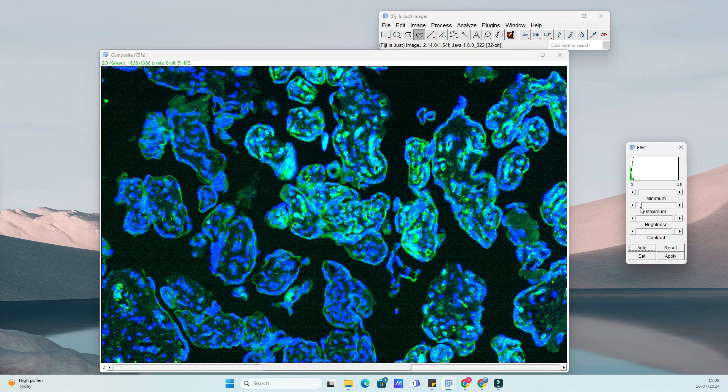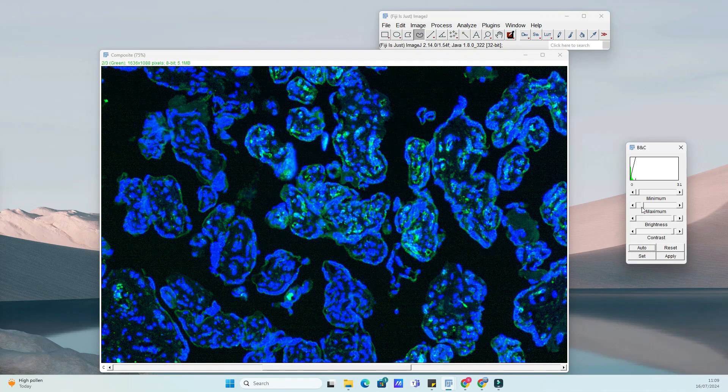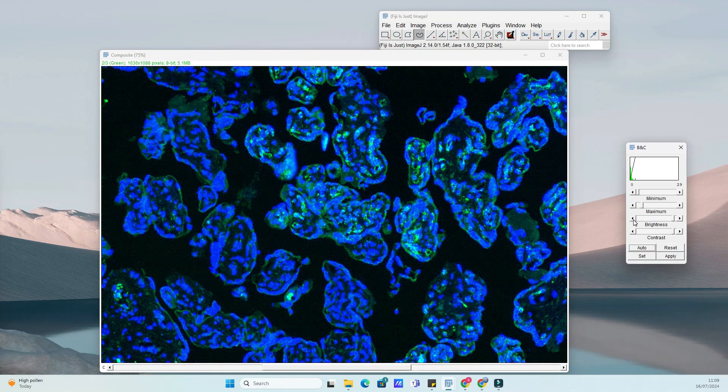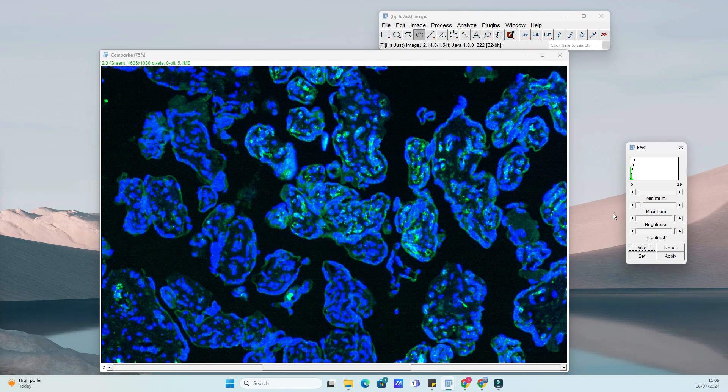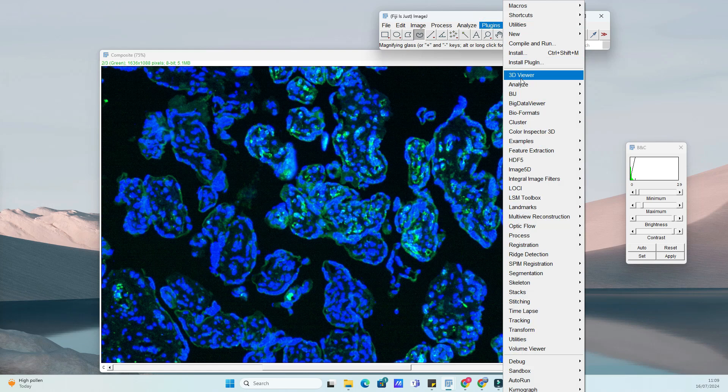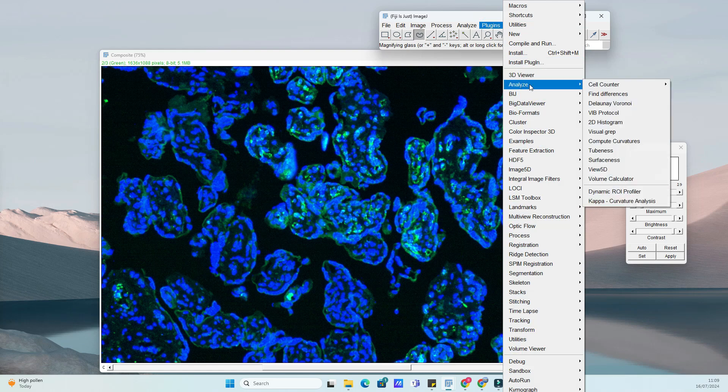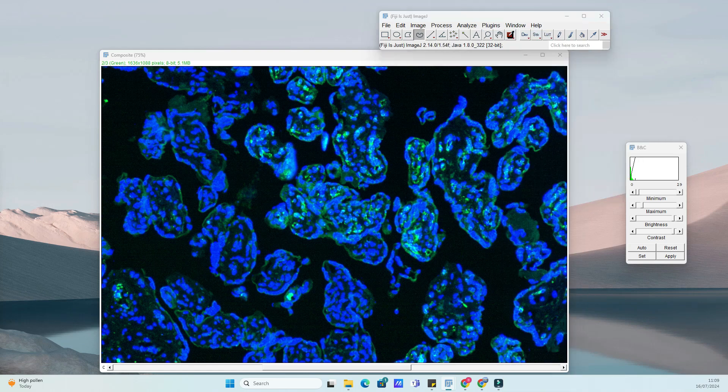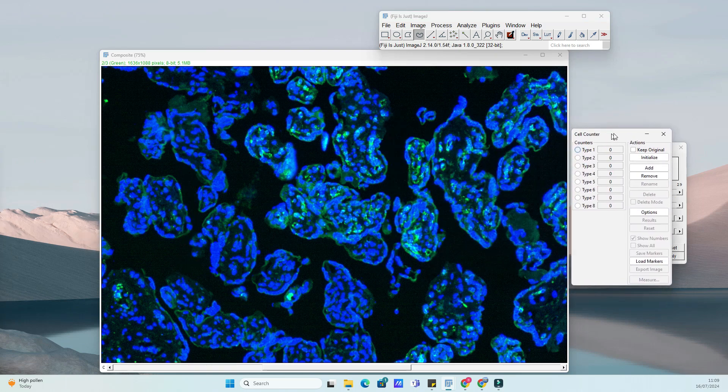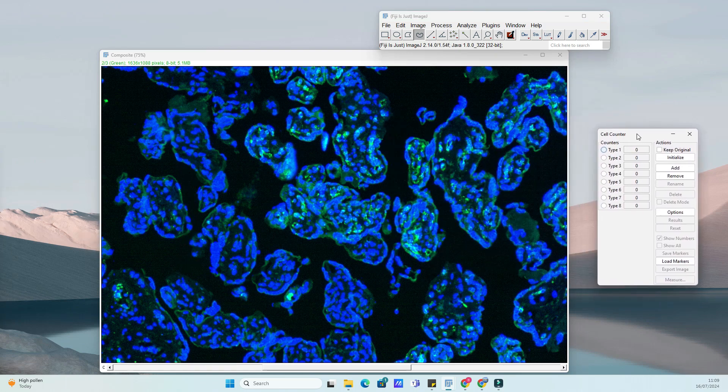First things first, let's make sure you have the Cell Counter Plugin installed in your ImageJ software. If you haven't already installed it, you can do so by navigating to the Plugins menu, selecting Install, and then searching for Cell Counter in the list. Click Install, and you're all set.